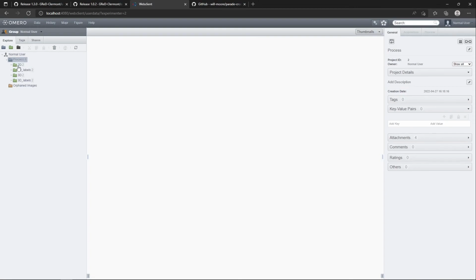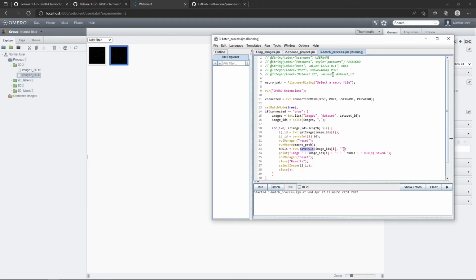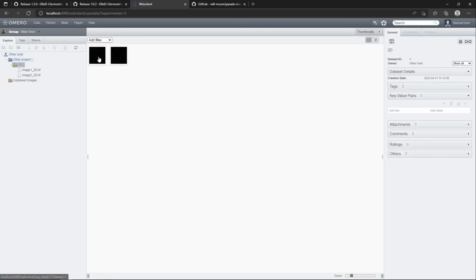And if I go back to this, we can see yes, it was the dataset number 1, so this one.